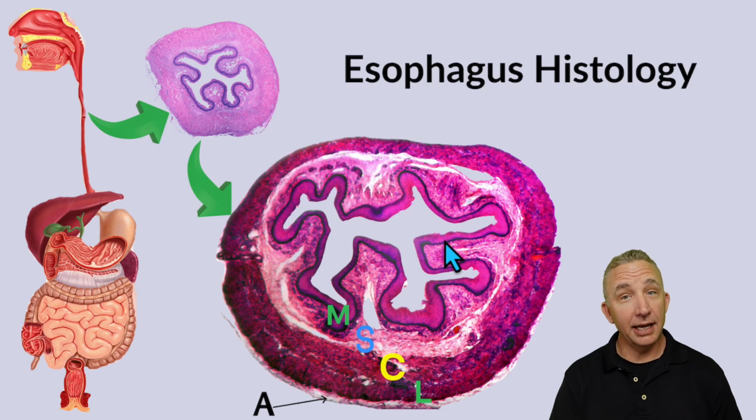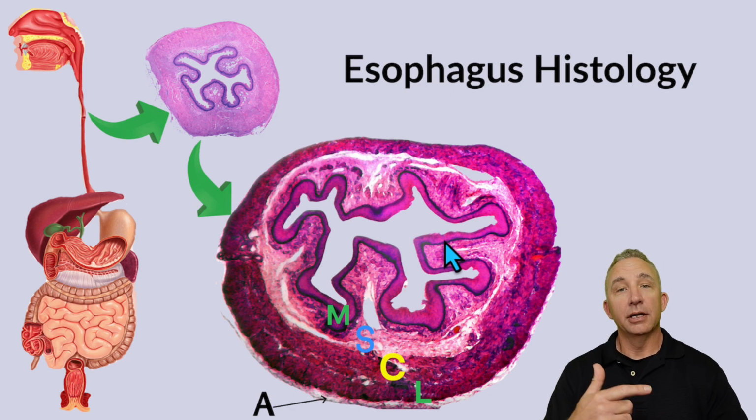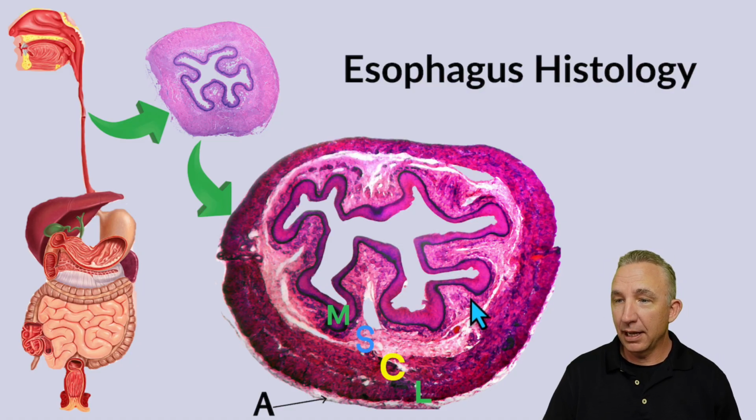As you study anatomy, you start to see the same things occur through different parts of the body. When you cover the integumentary system and you look at the epidermis to the dermis, the epidermis is epithelial tissue, deep to it is connective tissue. The body tends to repeat itself in how it's designed. So as I go deep to that and I see this pinker layer here, so I just see a change in appearance right after that dark line, this is all my connective tissue.